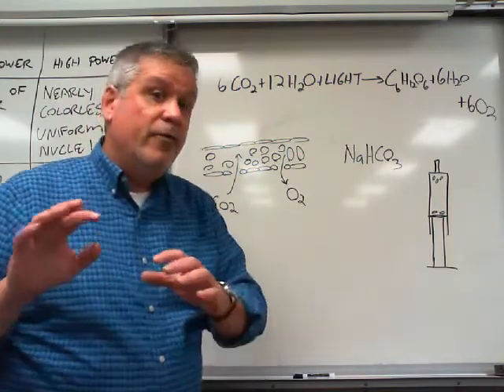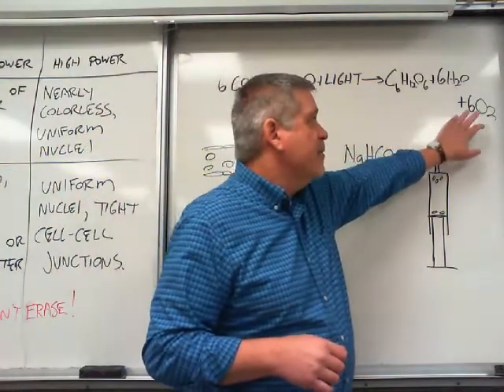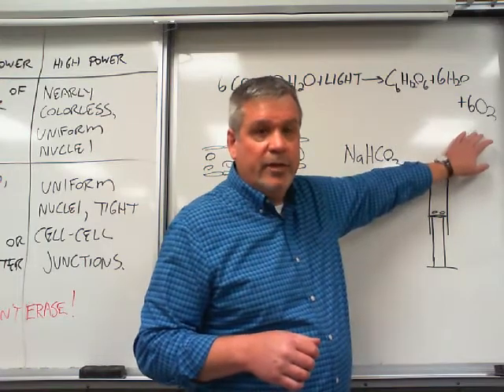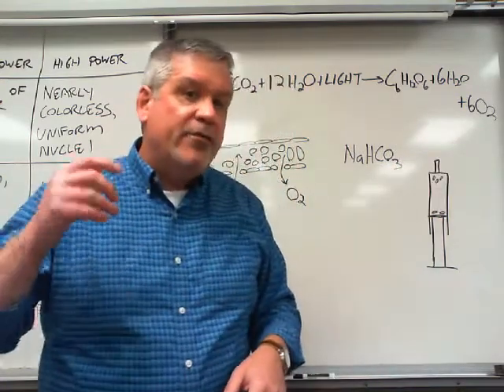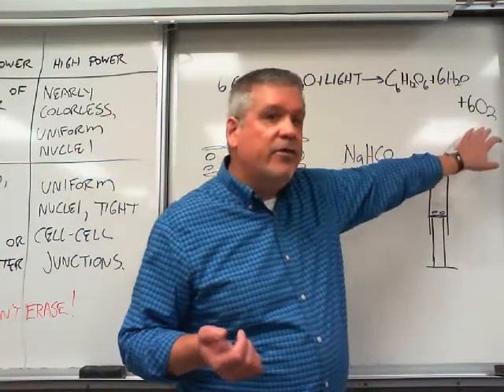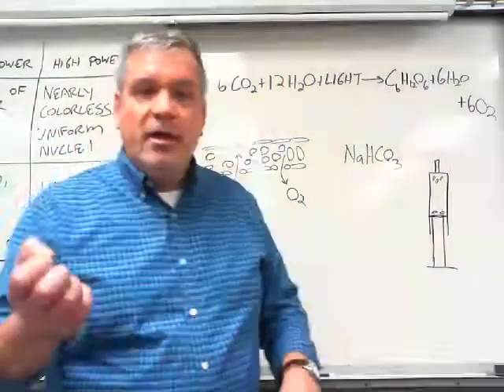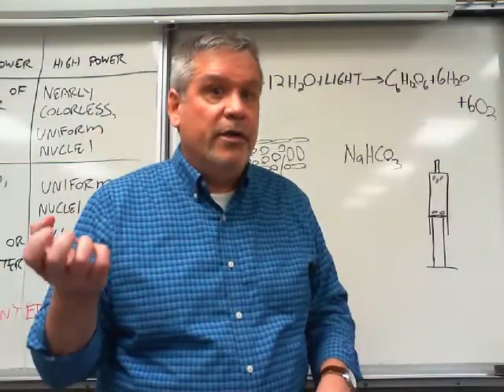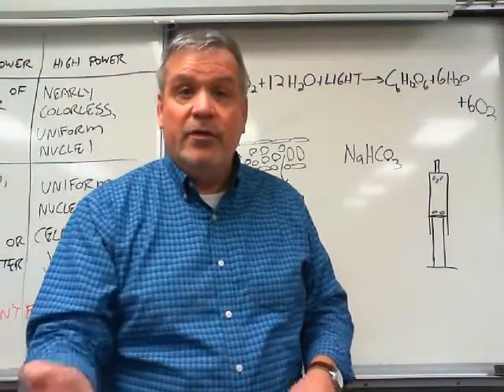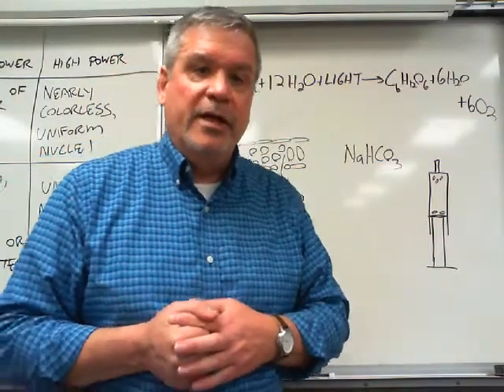Now, if we meet all the conditions for photosynthesis, we should get this reaction. This reaction produces O2, oxygen gas, right? So if we get photosynthesis, gaseous oxygen should begin to accumulate inside of our leaf discs. Oxygen gas floats. So if we start accumulating oxygen, the leaf discs will float. That means we have photosynthesis. Okay? So think about what the results might look like.